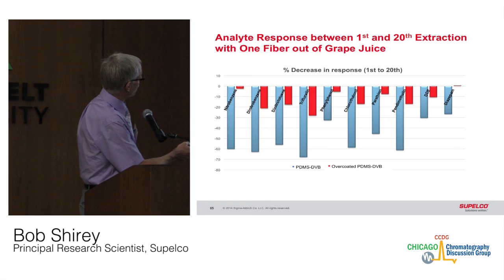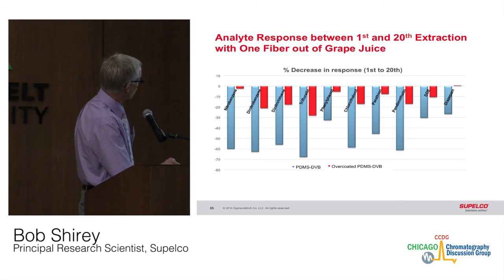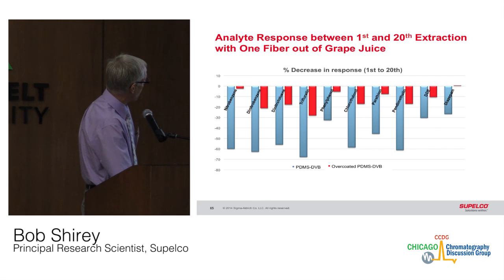This compares the first and 20th extraction, and this is the percent decrease between the first and 20th extraction. For the non-overcoated PDMS, the standard fiber, after 20 extractions out of grape juice, we get probably an average of about 40% loss of analyte across the board. Whereas with the overcoated, we have about a 10% loss of analyte on average.